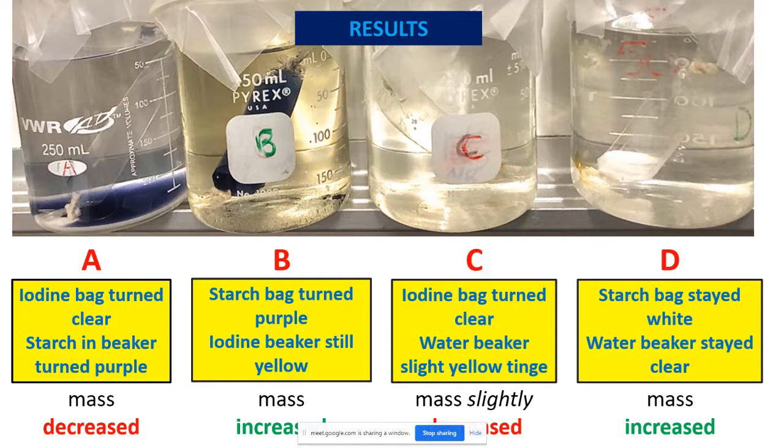Now, when you're talking about iodine and starch moving, you need to use the term diffusion, and you talk about how they can or cannot move with their diffusion gradients from high to low because it's all passive, and you decide whether they're able to move or not move and what the evidence is and whether the bag is permeable or impermeable to either iodine and starch. And you're going to use the results in yellow to kind of answer those questions.